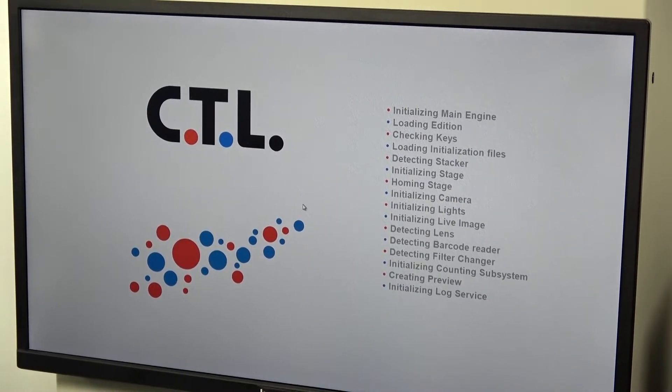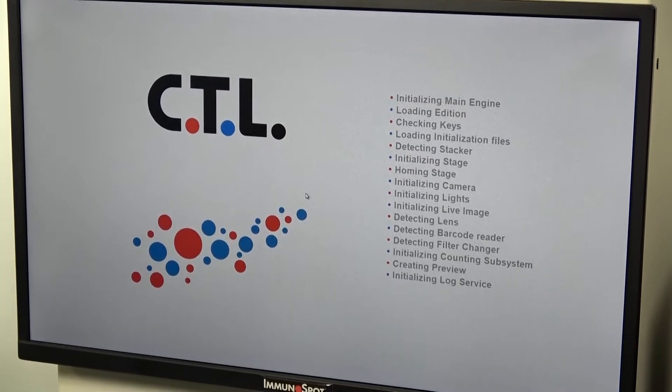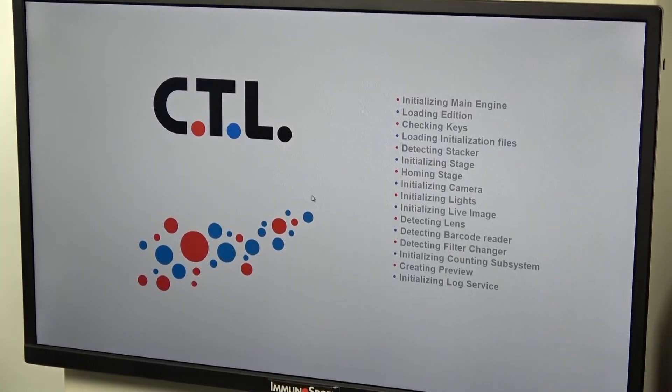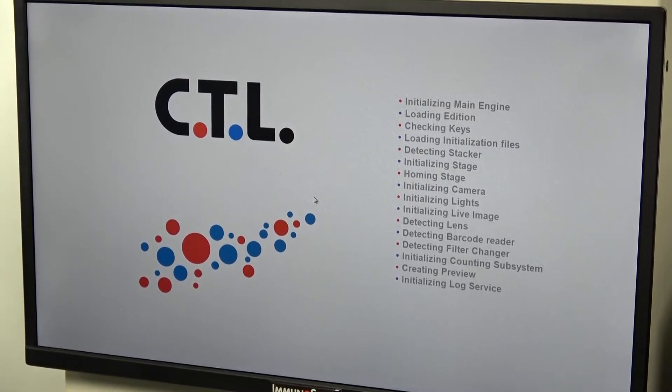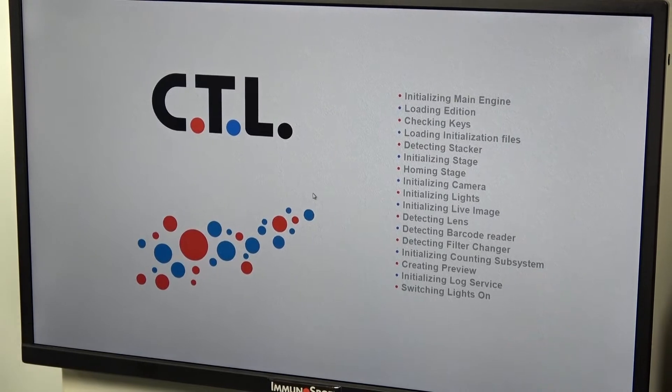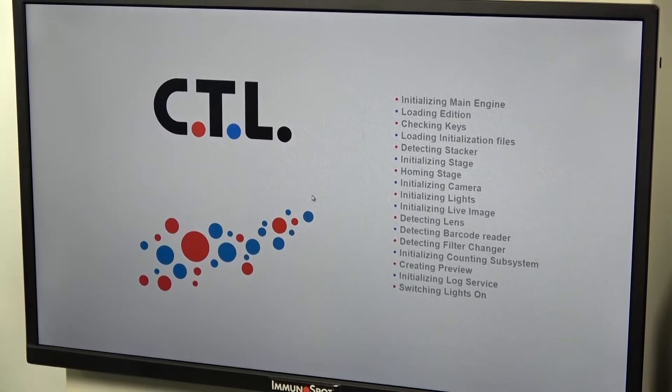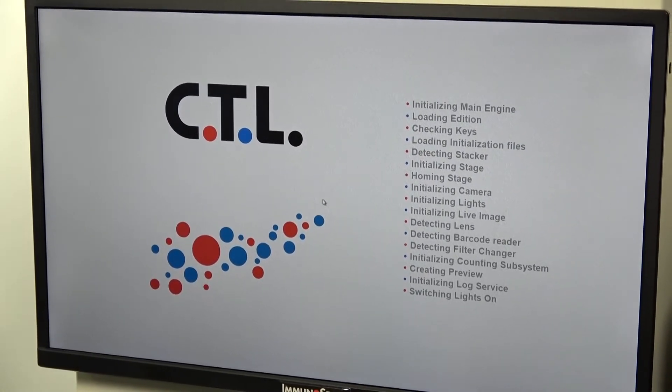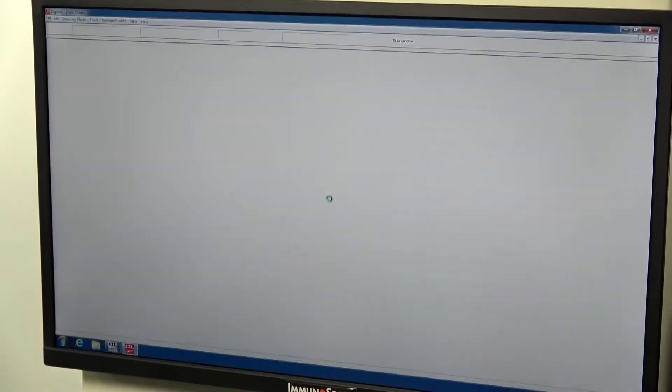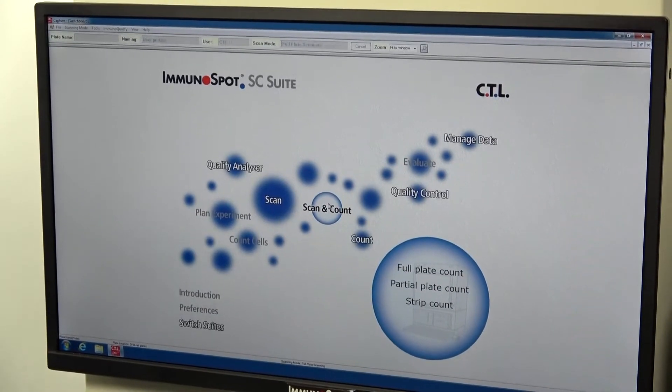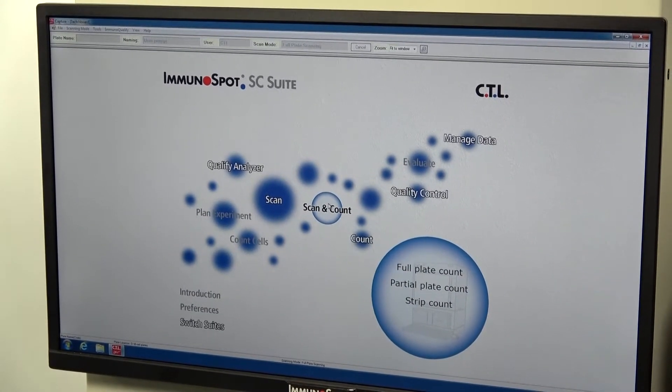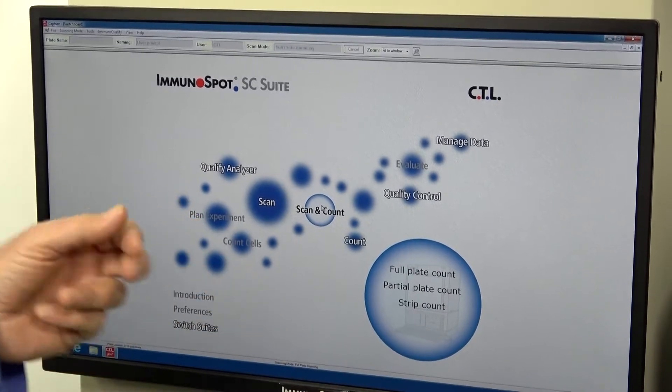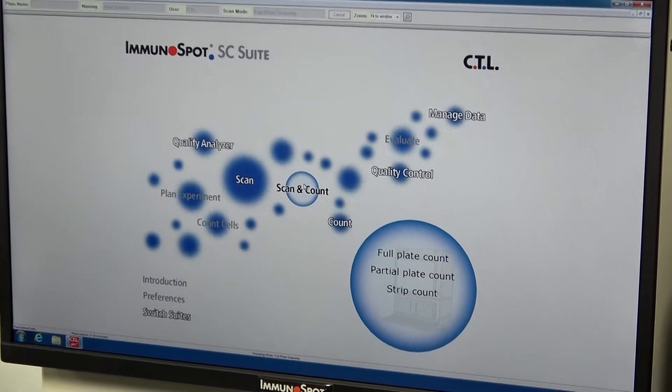Of course, this will count the colonies that it finds in a sample. This is designed for doing well plates, 96 well plates. We can do a full, partial, or a strip of that plate.